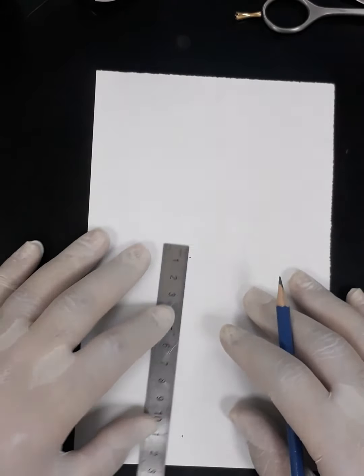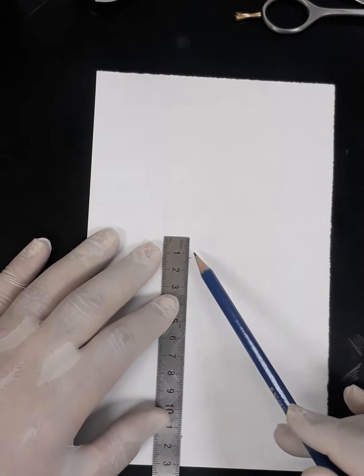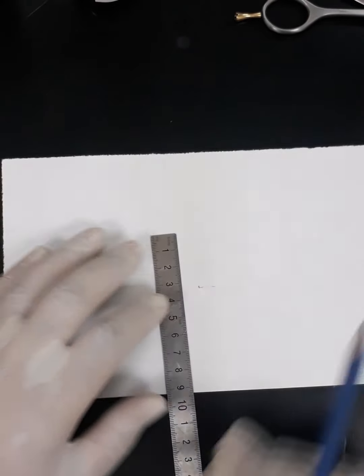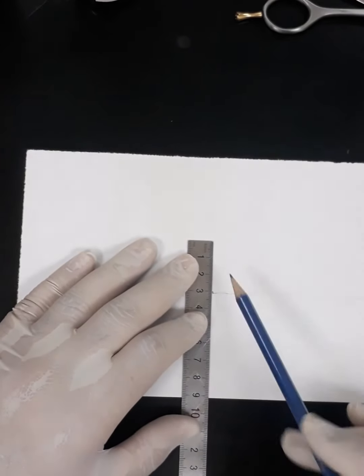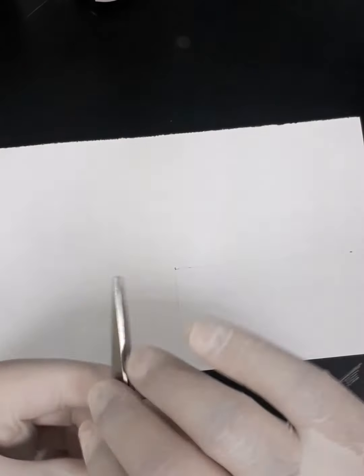Then with the pencil, we have to draw a very light line just as an indicator for the scissor, as later on we are going to cut this paper. So here again. Now, using the scissor, I have to cut the paper, and I have to be as accurate as I can.